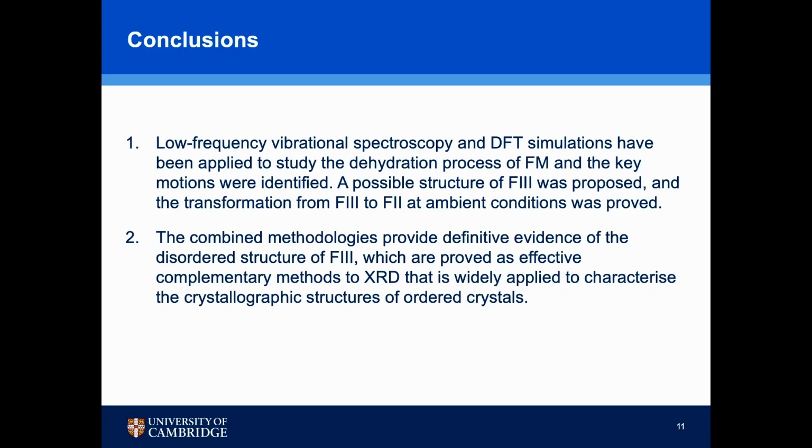Because our combined methodology gives us a lot of evidence of the disordered structure of form 3, we think it's a really effective complementary method to the classic XRD method that is widely applied to study the crystallographic structure of ordered crystals, while our combined methodology can also study disordered crystals.